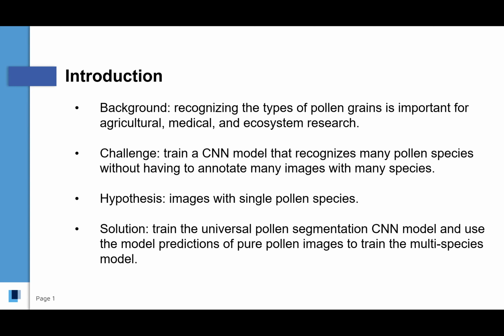To save manual annotation time, our method first trains a universal pollen segmentation CNN based on the semi-manual segmentation of pollen grains. This model is then used to automatically segment a large number of additional pure pollen images, so as to supervise the training of our multi-species segmentation CNN.